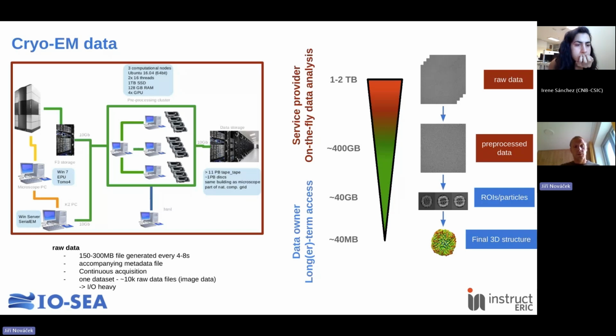Then ideally we would have a computational infrastructure near the microscope that would allow us to do the real-time analysis of the data, such that we can get feedback directly on whether the data quality is good, and subsequently transfer the data to the storage through which we can make the data discoverable by the owner.